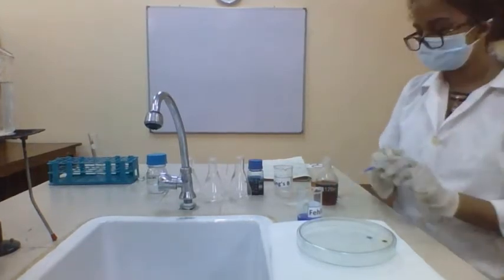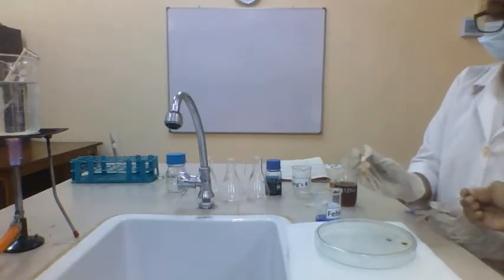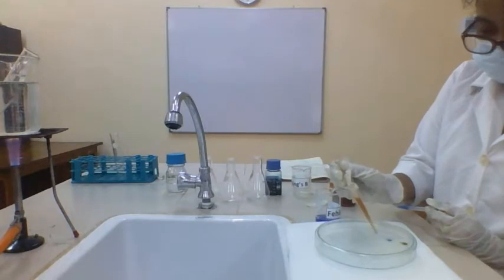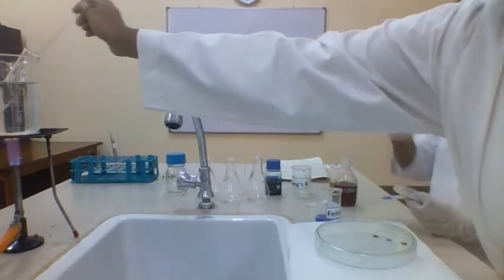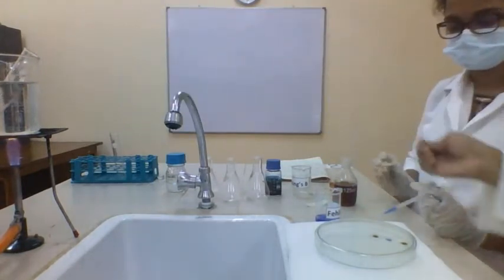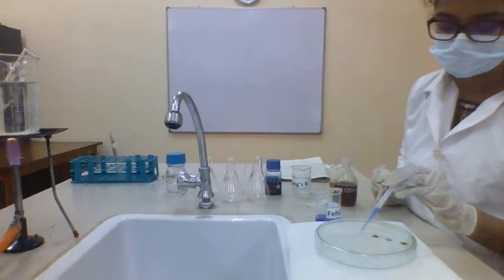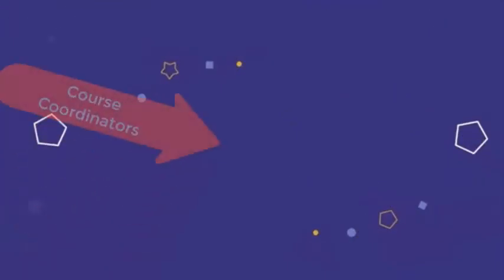Then wait for 2 minutes, and after 2 minutes repeat the same procedure. Likewise we are going to test these drops with iodine and Fehling's, and observe the color change of Fehling's and iodine.